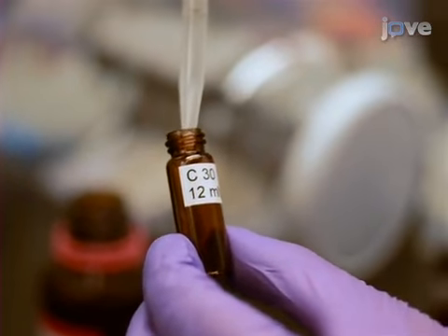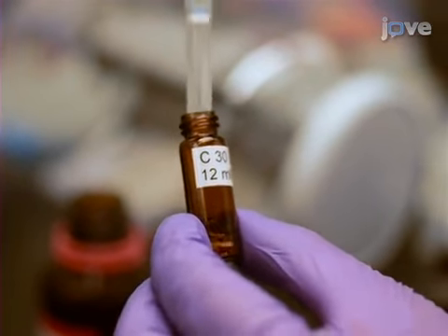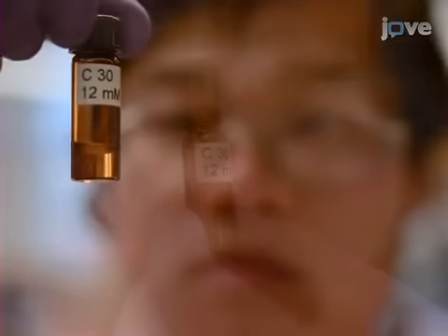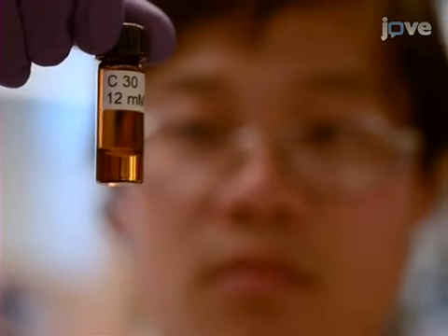Similarly, prepare a 12 millimolar stock solution of coumarin 30. Mix gently by pipetting. Visually verify that the dye is completely dissolved.